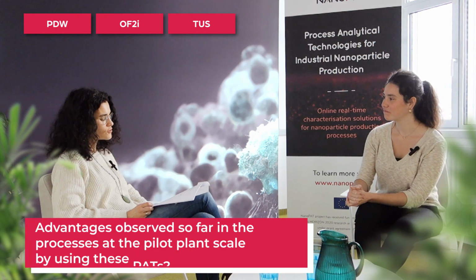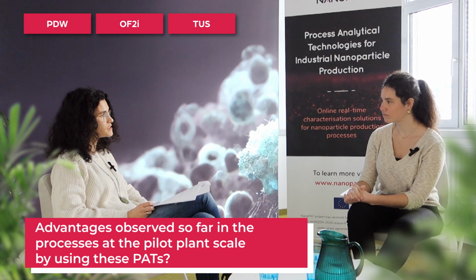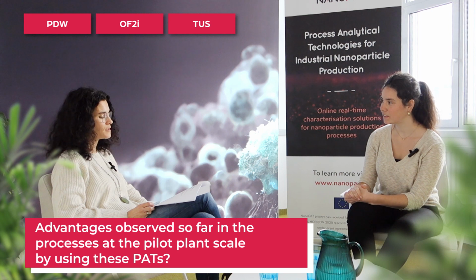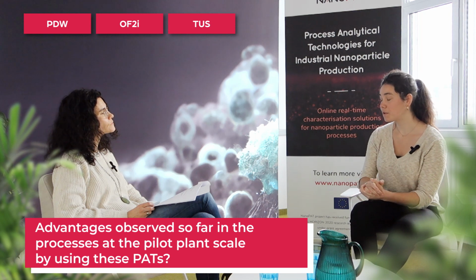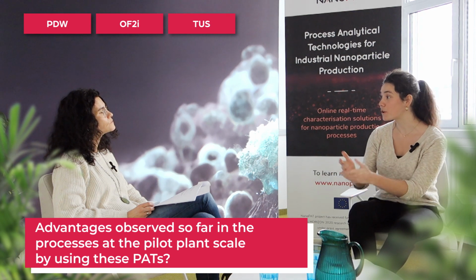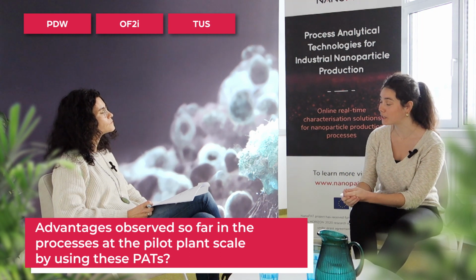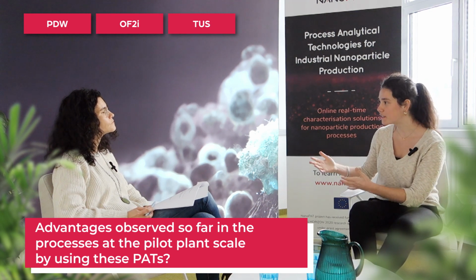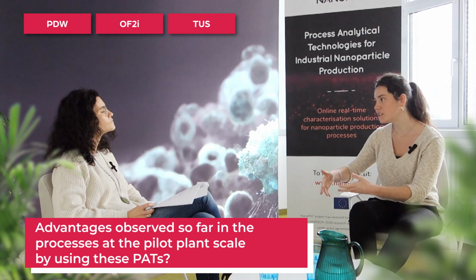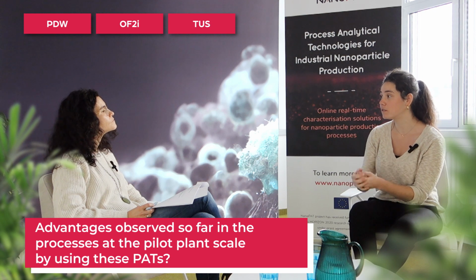And now that you have begun using these three different technologies, which advantages or benefits could you highlight by using them in your processes? Yeah, the first thing that I will highlight is that with the three of them, we are able to get information in real time, because till now, every time we wanted to know which was the particle size that we had in the reactor, we had to take a sample, go to an external technology, prepare the sample, and measure it. So at the end, it was quite time consuming, and we were not able to get real-time data.